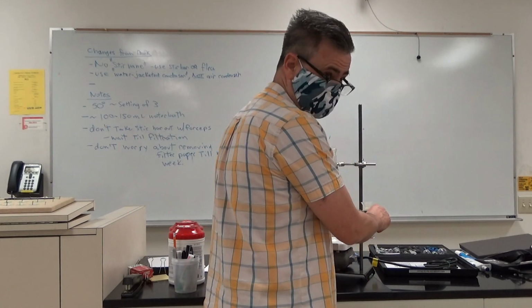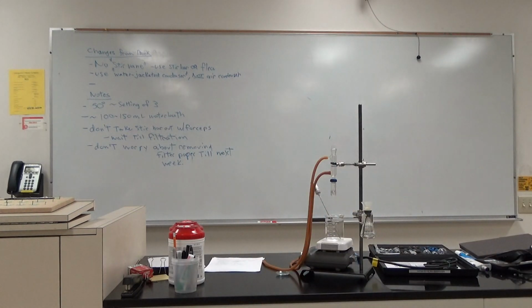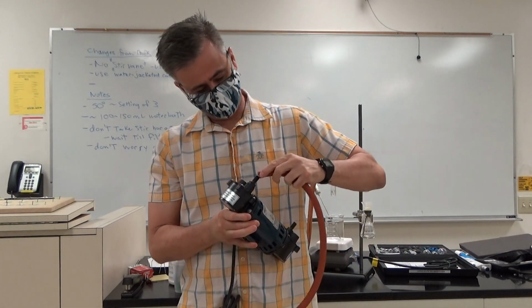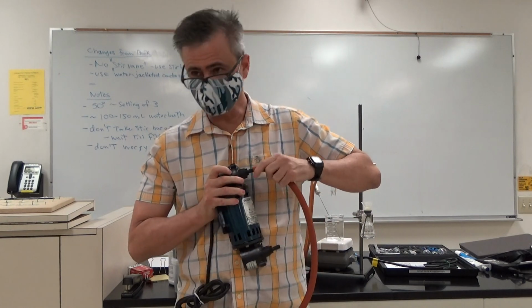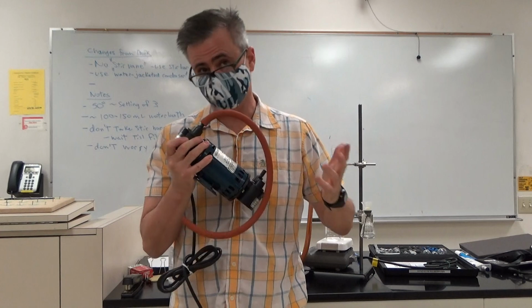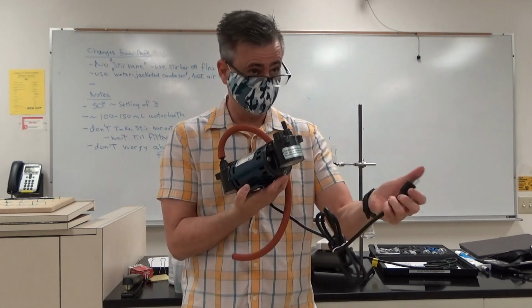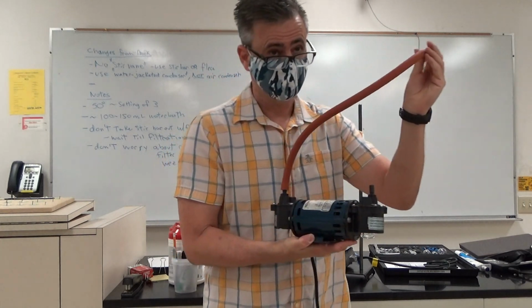Okay. Now you've got those blue pumps out here. Okay, so this fits over. 2 people can actually use these pumps at one time. We might have enough. I think we have enough where we don't have to share because we only have 8 people in class. And you turn them on by plugging them in, and then it's sucking through this.